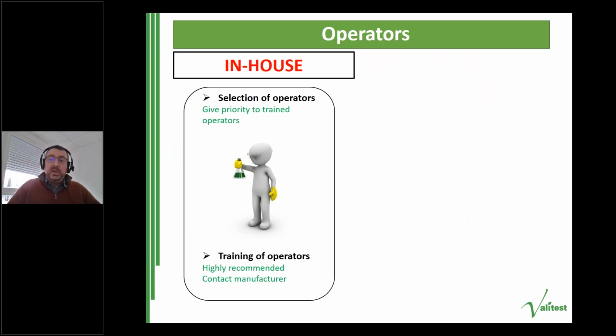Regarding the operators, they can have an influence on the test results. I will begin with the in-house case. The selection of operators should give priority to the trained operators, of course, if you have them in your staff. Otherwise, you should think about training your operators, which is highly recommended. In that case, you should contact the manufacturer.